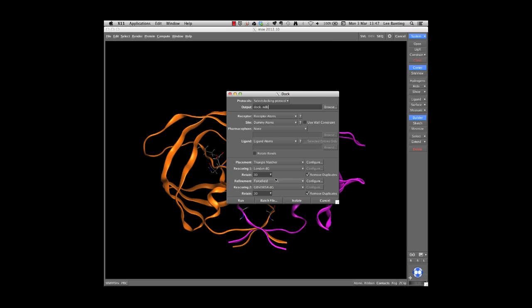That's going to make the job a little easier and quicker so you can see it in real time. There are various technical ways of matching your structure to the white and red spheres, and scoring the outcome with respect to energy. I'll show that to you in a moment. But first of all, we're going to get the job running.